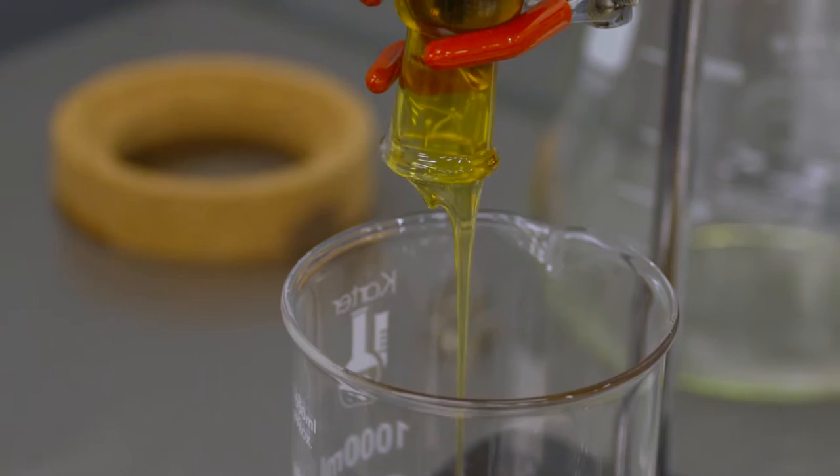We use rotary evaporators as a method of solvent recovery post the winterization process in our refinement methods for producing what are known as absolute oils, that can be used for infusion of basically any different type of medical cannabis product.